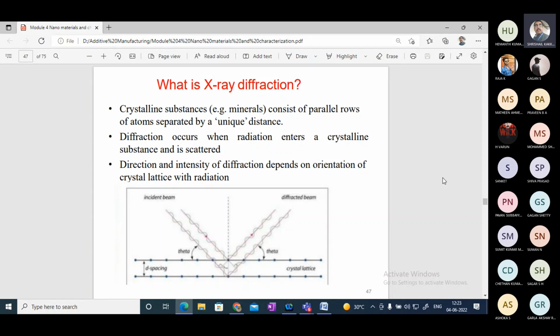So the XRD is slightly different from others. It has its unique applications. Whenever you want to find out a cluster of information, like the orientation of the structure, the size of the structure, the dispersion of all these elements, and the density in terms of percentage, you can use this XRD, the X-ray Diffraction system.